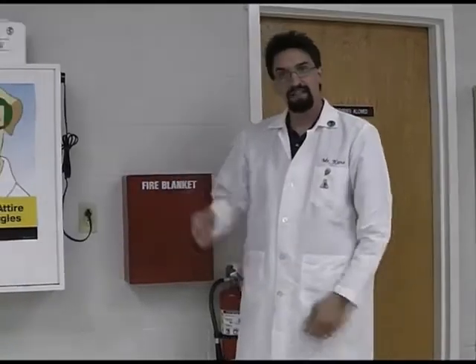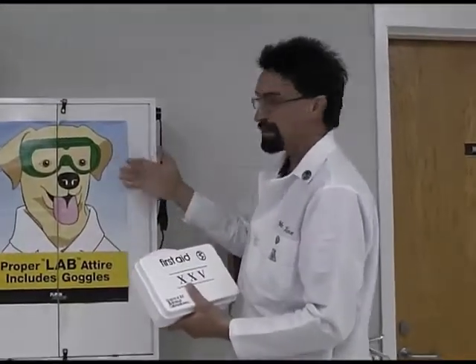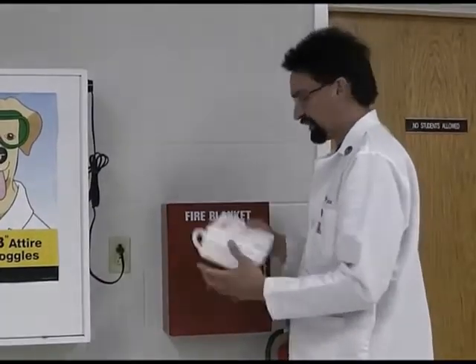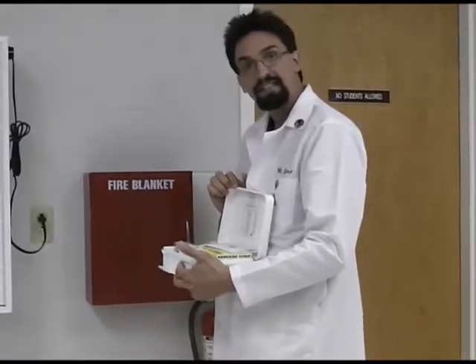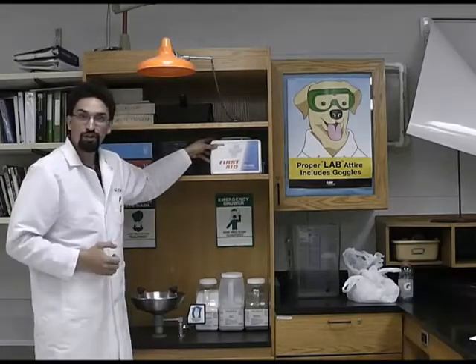The final piece of safety equipment on this side of the room is the first aid kit. We usually keep it on top of the goggle cabinet or on top of the fire blanket. We keep typical things like band-aids, antiseptics, gauze, and things like that. We do have more than one first aid kit in our rooms. There is another first aid kit located over by the chemical shower.